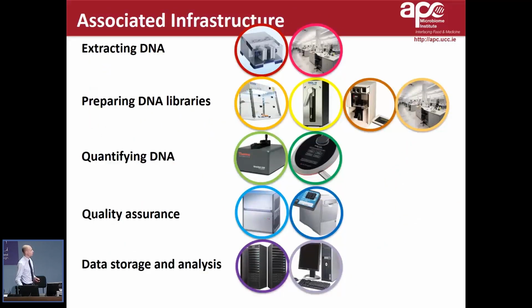Okay, so in theory, with some of these new benchtop sequencers, everybody could have a sequencer, but I don't think it's really quite as simple as that, because there are a number of different things to consider. First, you need to have instrumentation and expertise with regards to how best to extract the DNA, to prepare the associated libraries, and to make sure you don't get cross-contamination. You need to be able to quantify the DNA, ensure its quality, and then have various different means of storing the data, and analysis is a key feature.